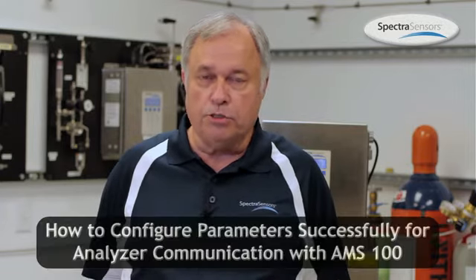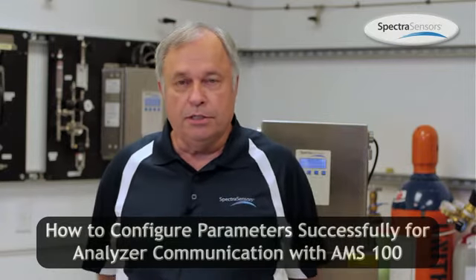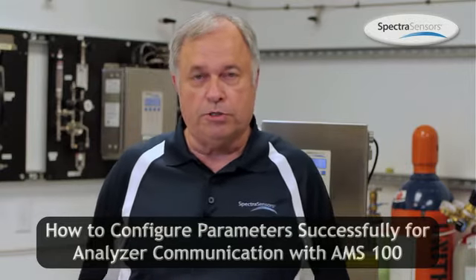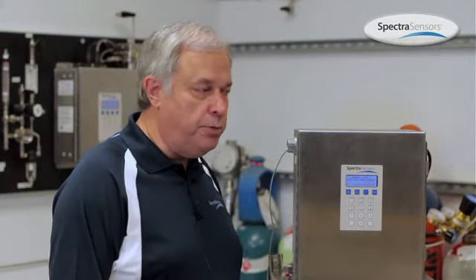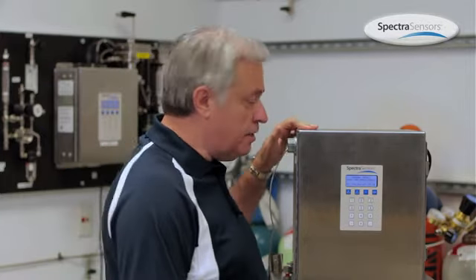What this video will do is explain those parameters and how you work with AMS100 to get those parameters configured successfully so that AMS will communicate with the analyzer. For AMS100 to successfully communicate with the analyzer, we need to know certain information about the analyzer. And we do that this way.